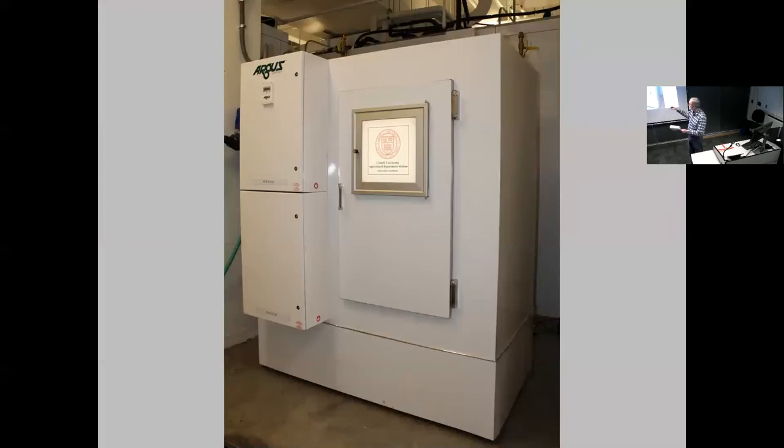You've seen these boxes often. You go to the supermarket, there's plenty of them there. They all say ICE on the side. So I just asked them to send me one without the decal. The control system took months to get also. We went with Argus, and each one of those can cost up to $10,000 each depending on the components that you would want to have in any particular situation. This is the same company that has controllers in most of Cornell greenhouses now. They have lifetime support for their equipment, which is kind of rare in growth chamber land because if you've got a commercial chamber, most of them stop providing support for their controller after about five years. And then you have to buy used parts or you have to buy another controller for thousands of dollars. So Argus, their system can call me, text, or email me if there's a problem, and I can log in at home, find out what the problem is, or I can adjust the settings of any chamber right from my office desk or right from home. So it's very convenient.